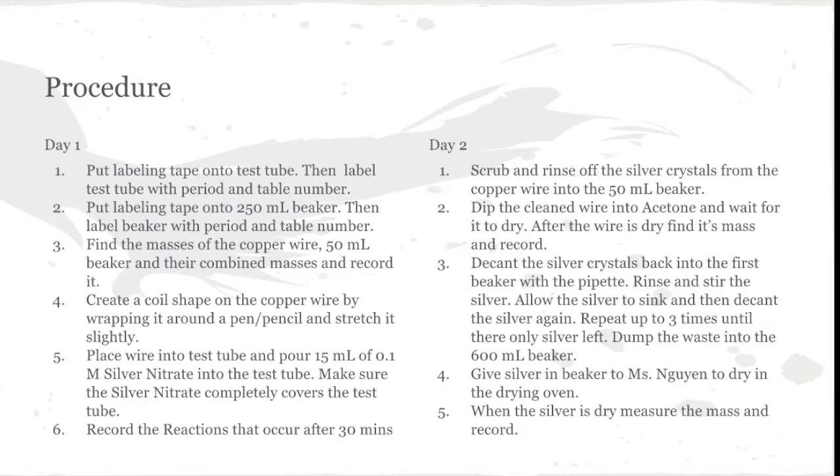Place the wire into the test tube and pour 15 milliliters of the silver nitrate. Make sure the wire is completely submerged. Record the reactions that occur in the next 30 minutes.